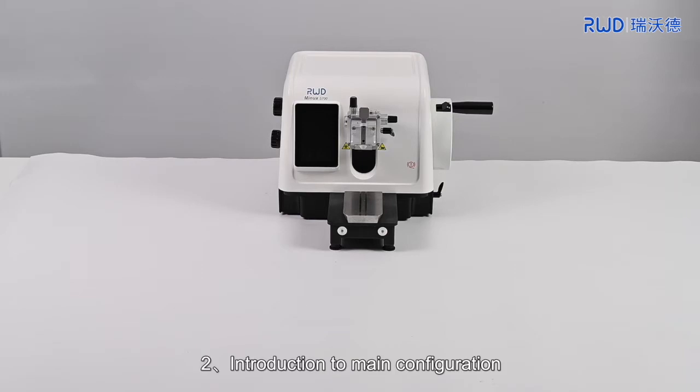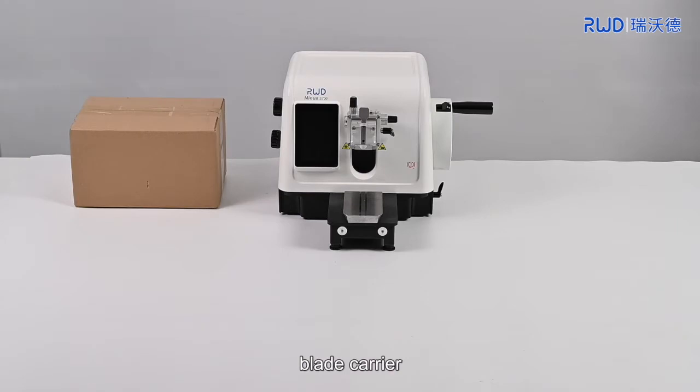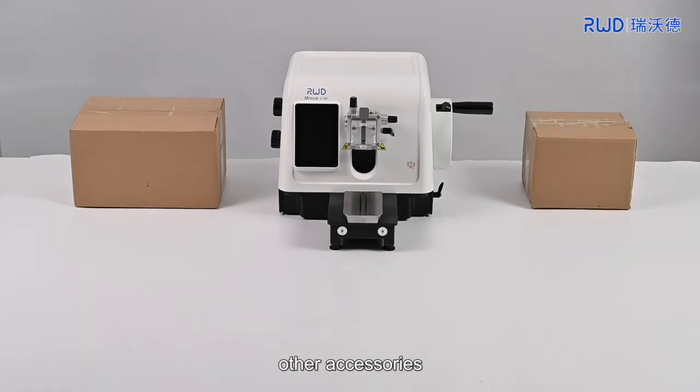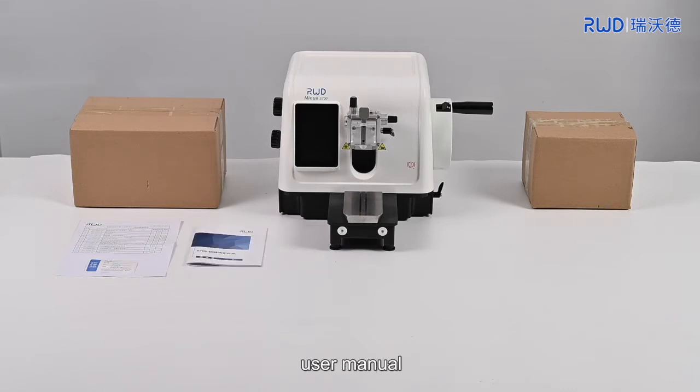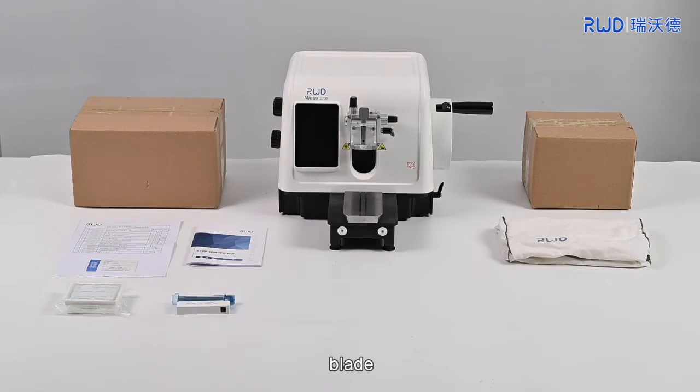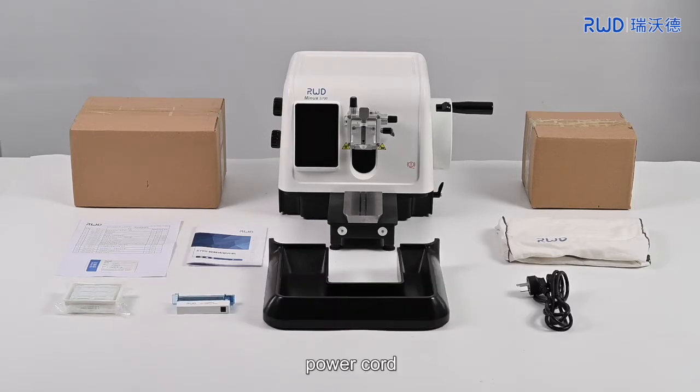Introduction to main configuration: Post, blade carrier, other accessories, certificate of approval and configuration list, user manual, cloth cover, slide, blade, Addle tray, power cord, and internal hexagonal wrench.